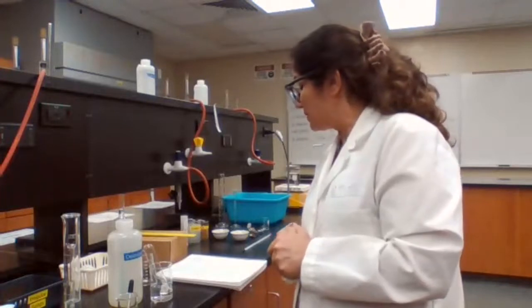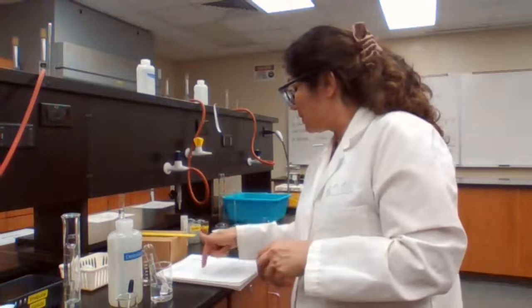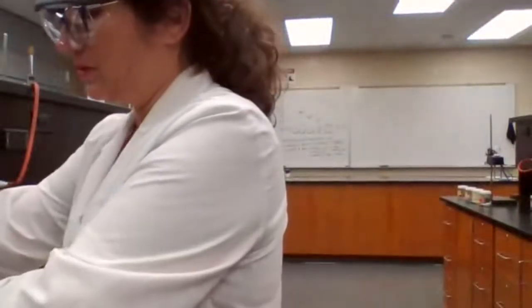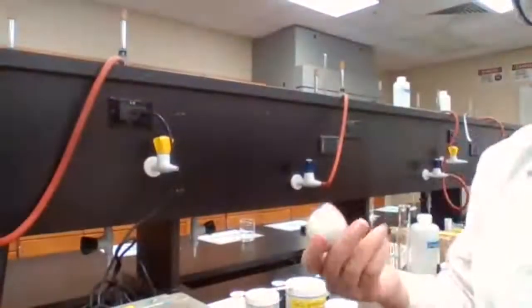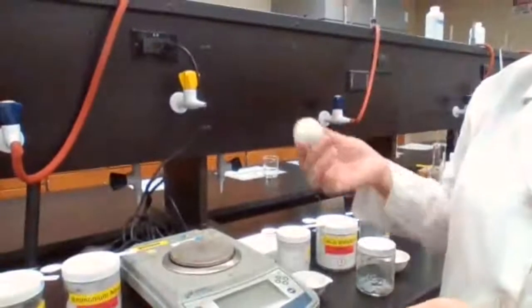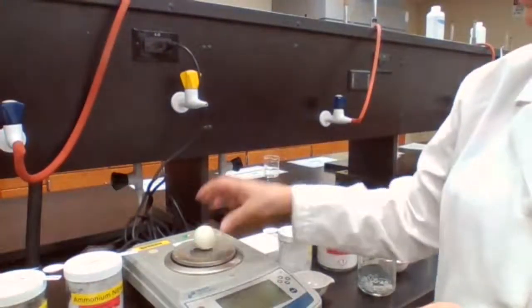Density of the solid. We want to measure the density. We don't measure the density. We basically calculate the density, but in order to get the value for density, we need the volume and we need the mass. We already have the volume. You can calculate the volume for the golf ball. And now I'm going to give you the mass for the golf ball.